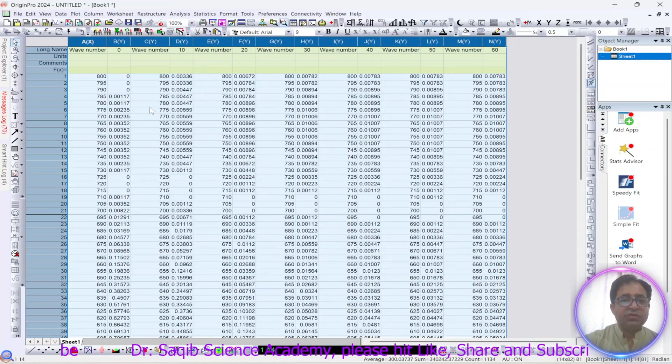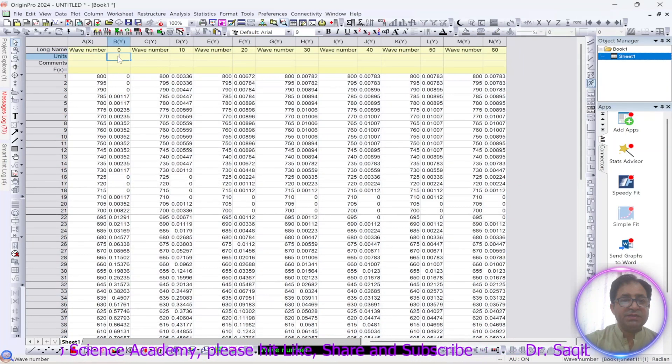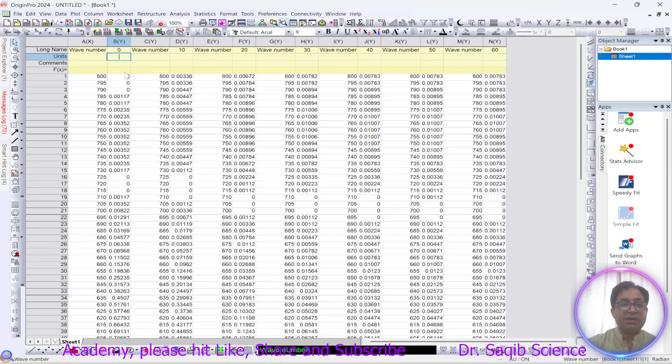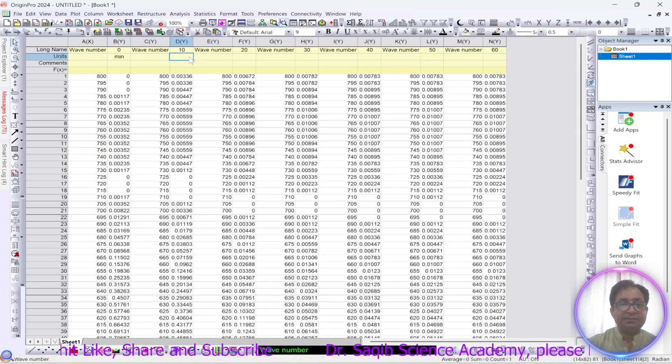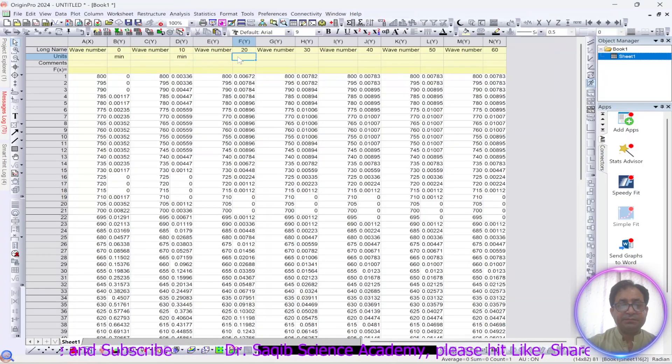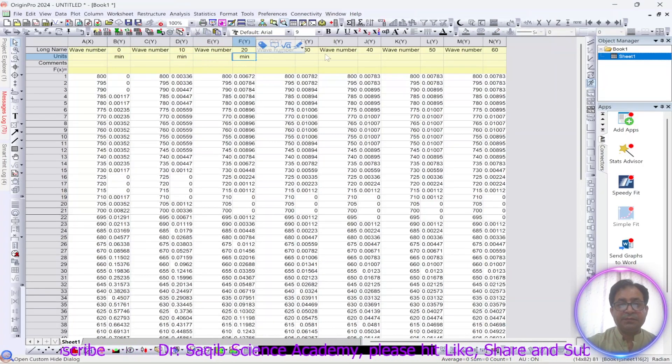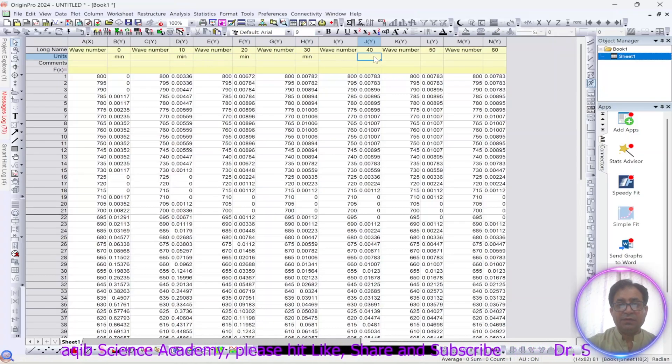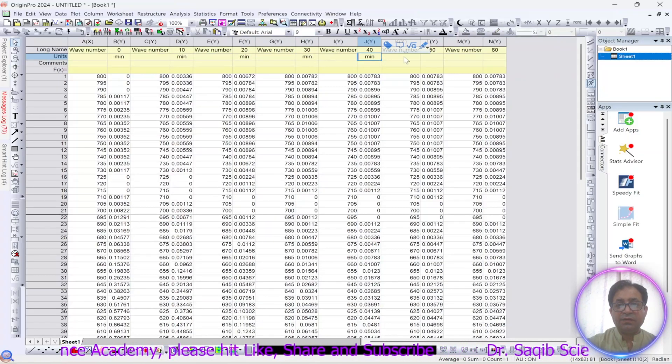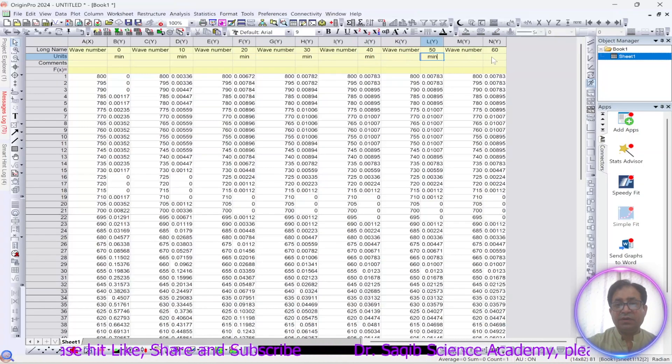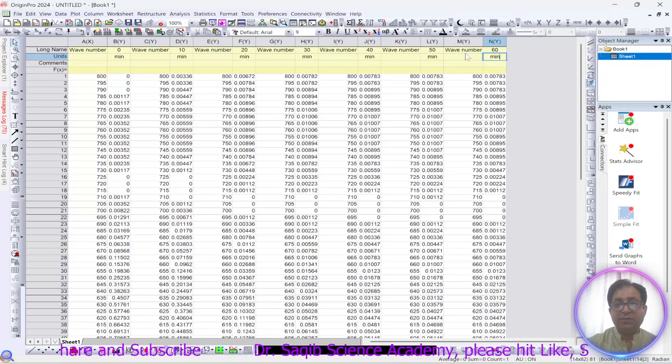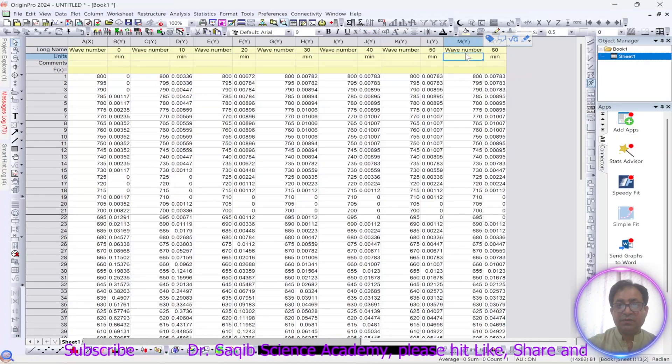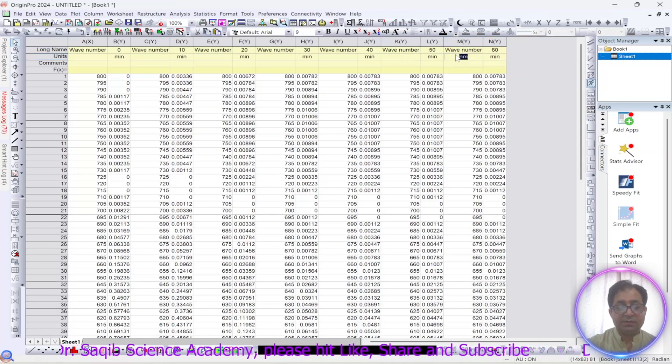So this is my wave number, this is time in minute, the absorbance at different time intervals, so I will write minute over here. You can copy paste or you can do it what I am doing. The wavenumber is in nanometer, so I will write the nanometer over here.